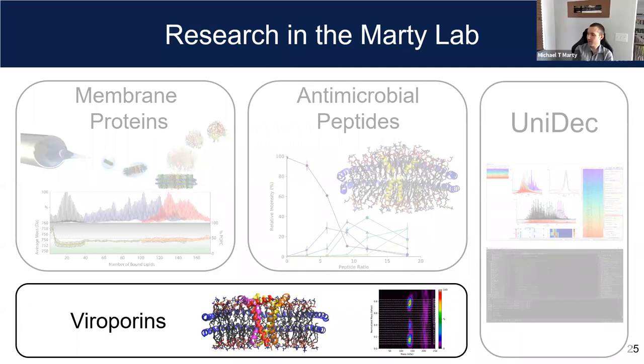So we, for a while, were trying a bunch of different MSPs. We tried some of the circular MSPs, but had some issues trying to get them to work. We did a little bit of work with the Delta 5 version, which is smaller, and we got some really nice data with that.